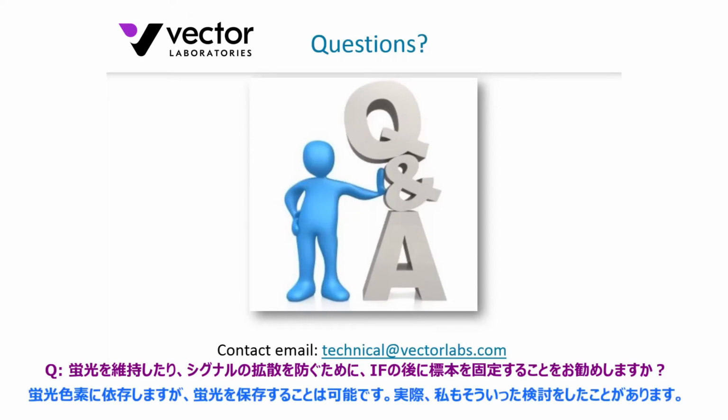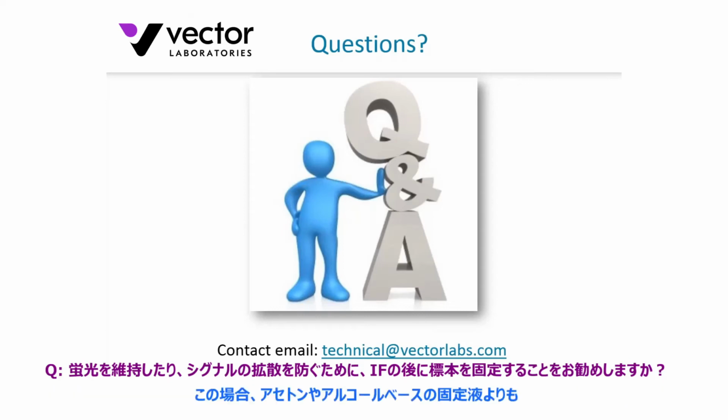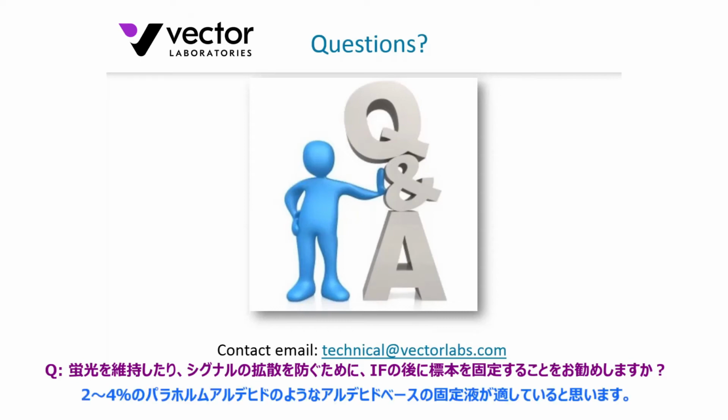Preservation of fluorescence, though, yes, certainly depending on the fluorophore, that may certainly preserve the signal. So yes, I would certainly explore some of those parameters. I would say probably an aldehyde-based fixative, something like 2 to 4% paraformaldehyde, would be recommended in those circumstances over something like an acetone or some other, I'll call it an alcohol solvent-based fixative.